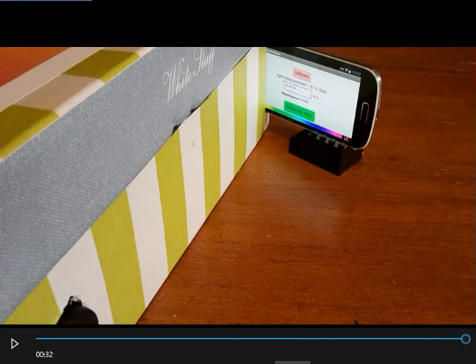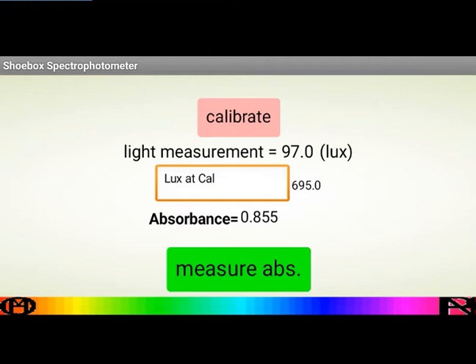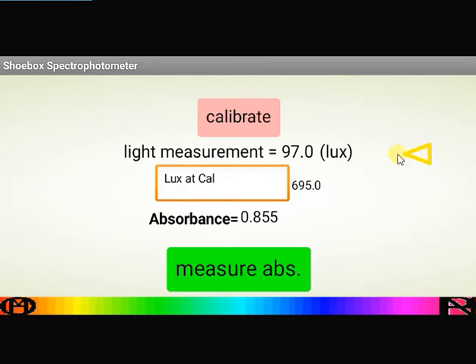This is a screenshot of the app. It's got a calibrate button. Well, actually, first off, it's got this value here.